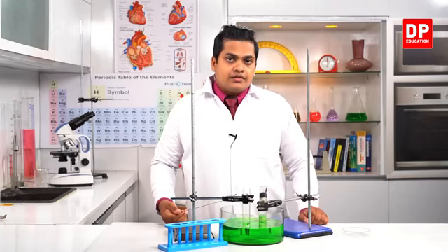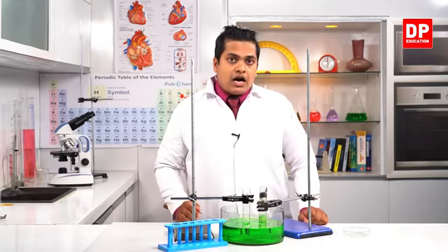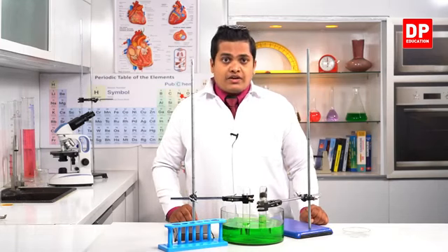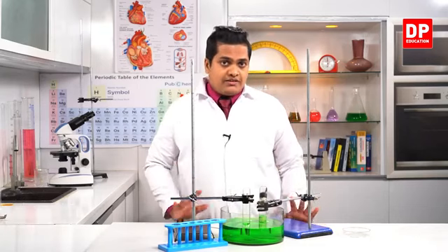So that is our conclusion from this activity. Water has risen up about 1/5 of the entire volume in the boiling tube.